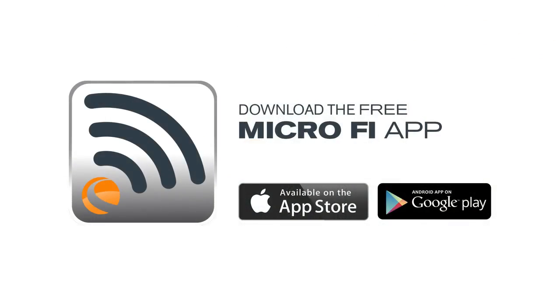The free MicroFi app is available at the Apple App Store and Google Play.